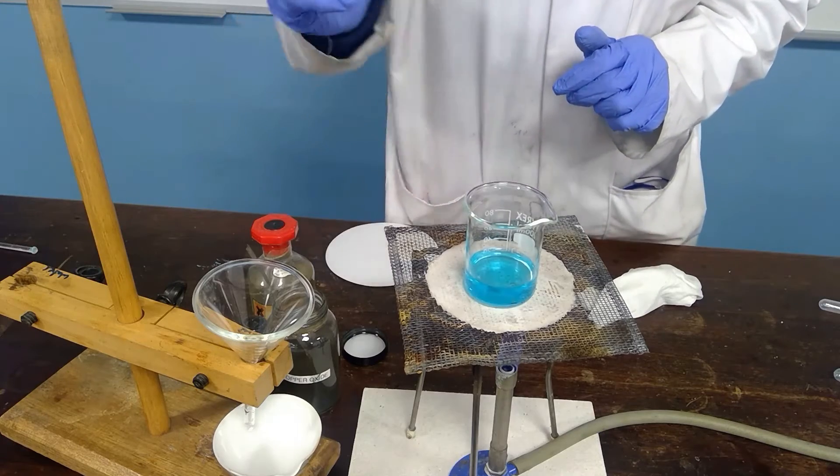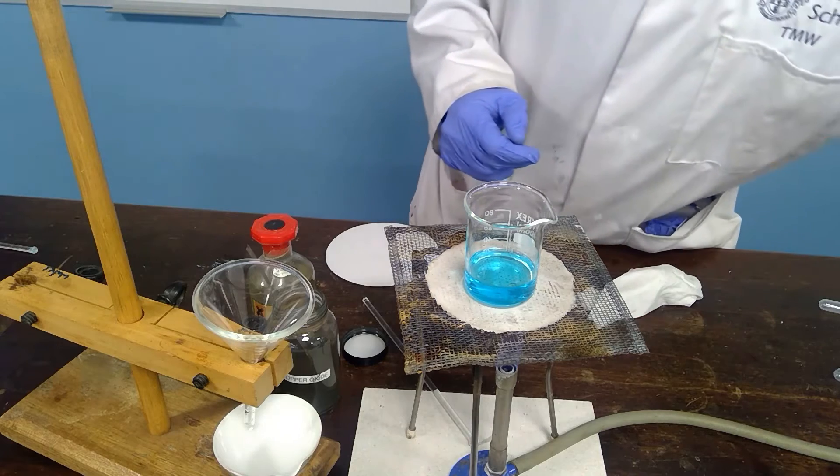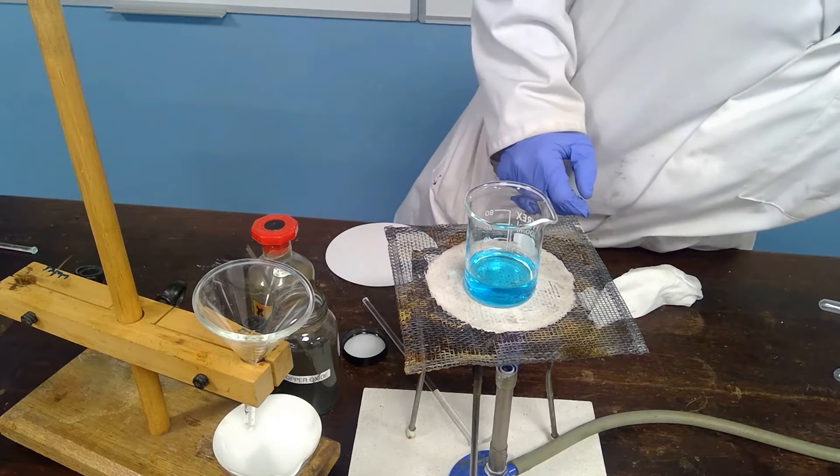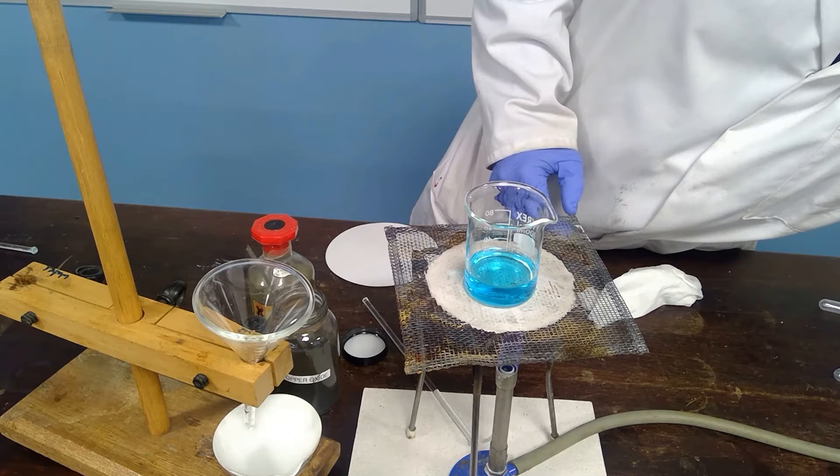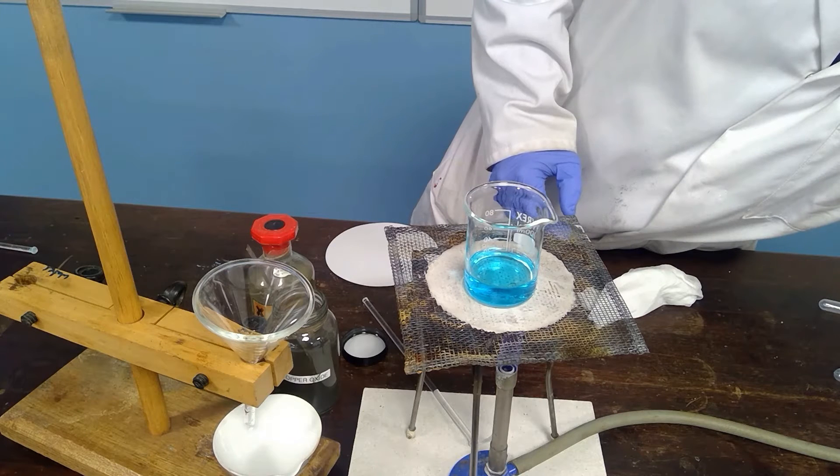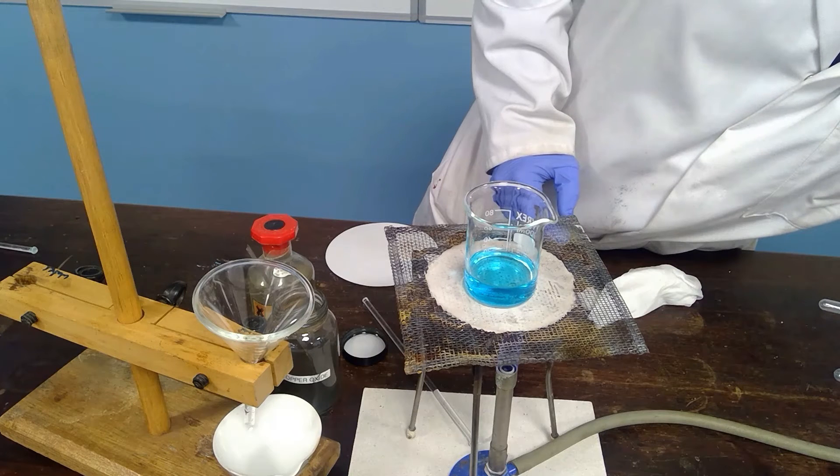Now at this point we have the sulfuric acid at a good temperature for the reaction so the Bunsen can be turned down and more copper oxide can be added.